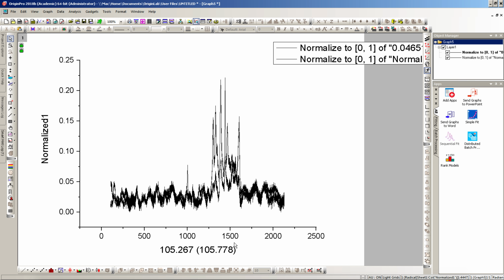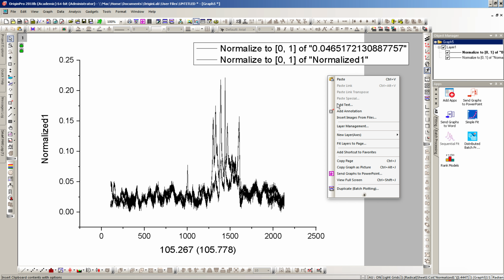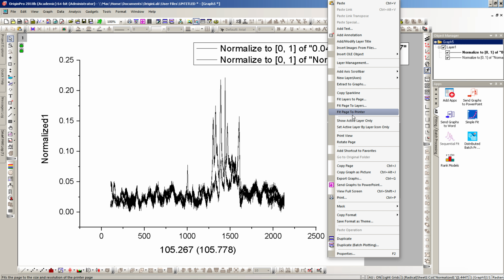Then what we need to do now is to make it look okay so that we can see the actual differences. So you have already here the scale. So I will just ask the software to make it again, reconstruct the legend, and let me do that. Reconstruct legend.